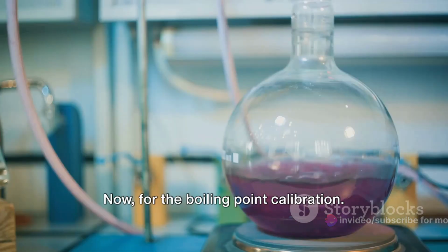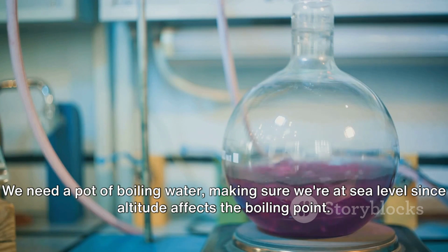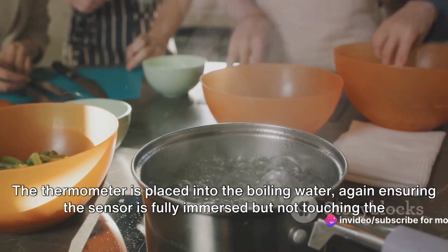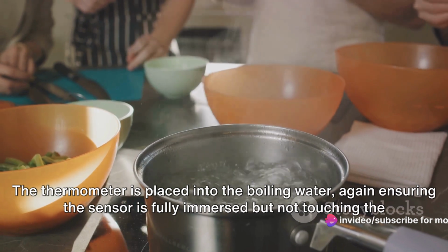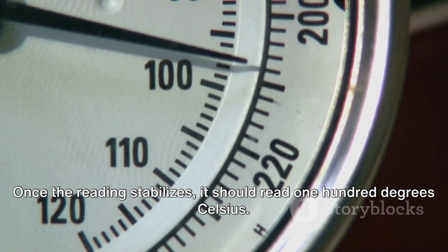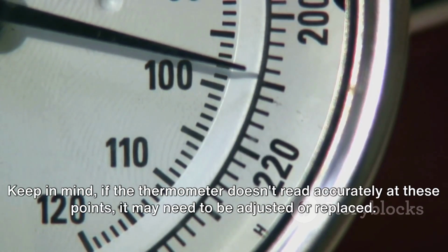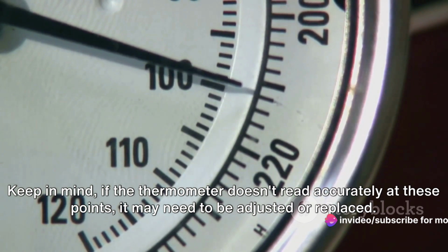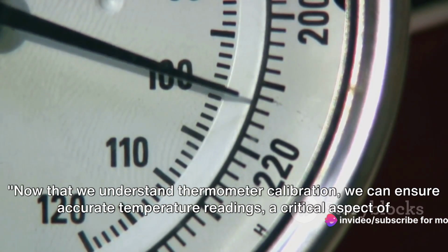Now, for the boiling point calibration. We need a pot of boiling water, making sure we're at sea level since altitude affects the boiling point. The thermometer is placed into the boiling water, again ensuring the sensor is fully immersed but not touching the sides or bottom of the pot. Once the reading stabilizes, it should read 100 degrees Celsius. Keep in mind, if the thermometer doesn't read accurately at these points, it may need to be adjusted or replaced.